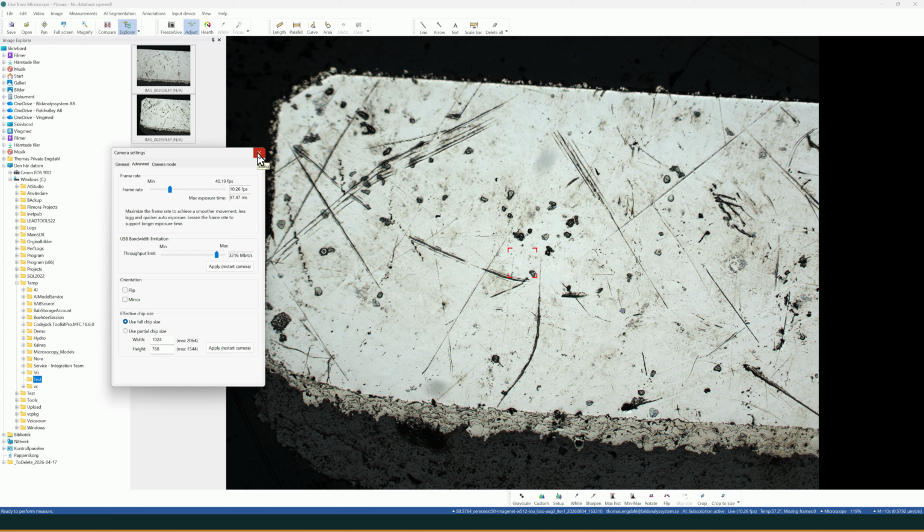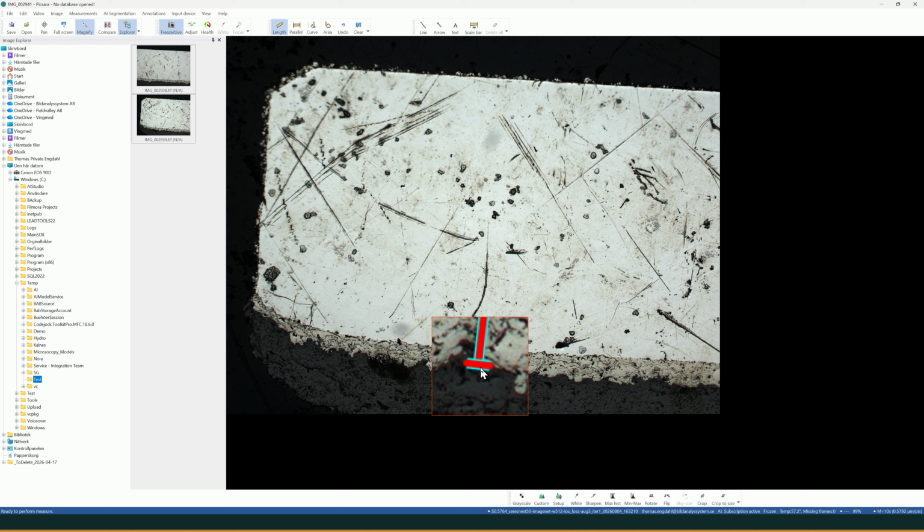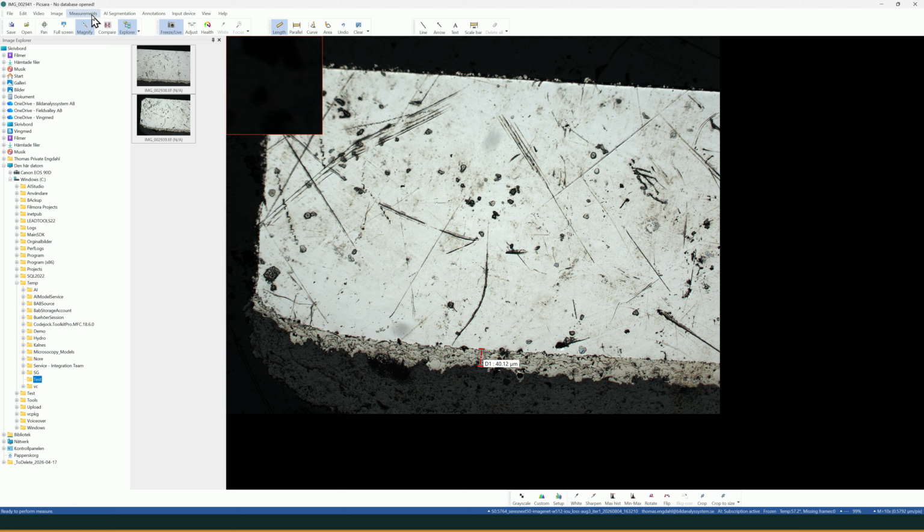On top of this, you can zoom into the image, and you can zoom into the live image, and you can see it's a live image now. It's a little bit noisy. And you can use the magnifying glass if you rather like that. And you can actually use them in combination with the measurement tool. So if I want to be very precise, yeah, it doesn't make sense in this case, but it can be helpful.